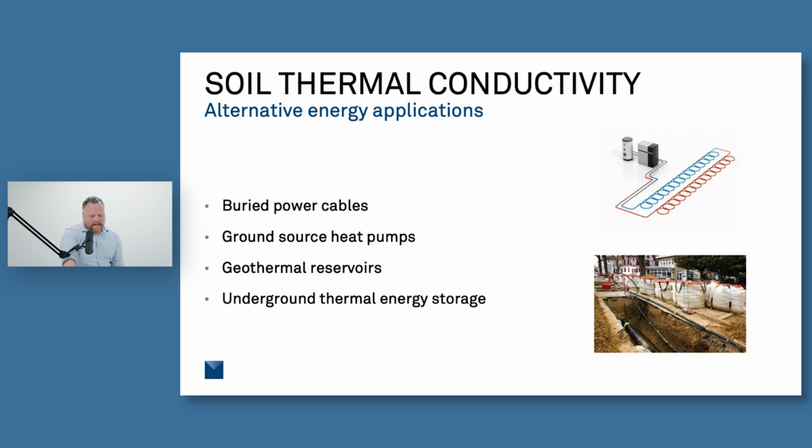And then there are also applications for things like solar farms that will use the excess heat from the solar panels during the day and store it in some kind of reservoir underground for use later, when the sun's not shining. So at nighttime they can use that to generate electricity still. So you need to make sure in those cases that you have something with enough thermal conductivity to get that heat into it, but that'll hold on to it so that it doesn't just dissipate directly to the surrounding soil.